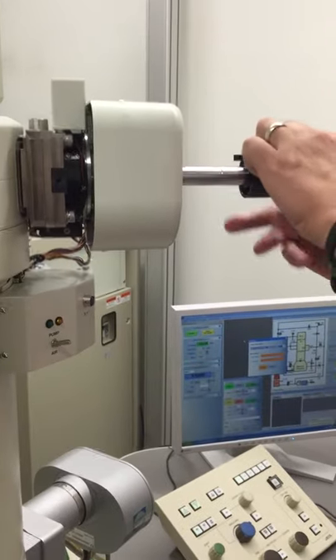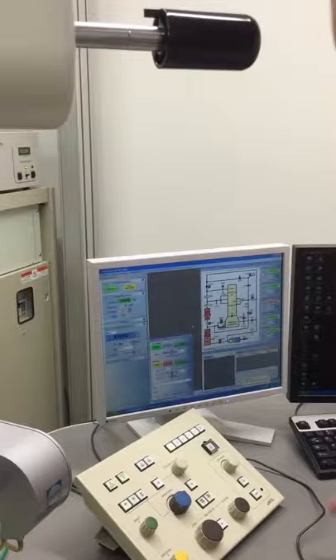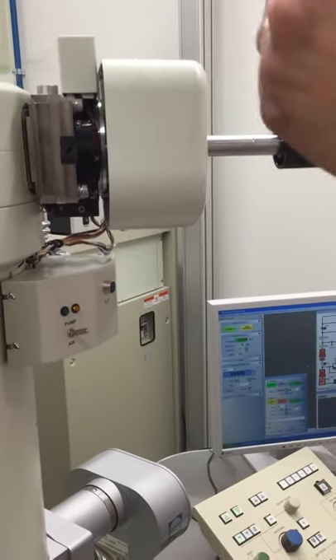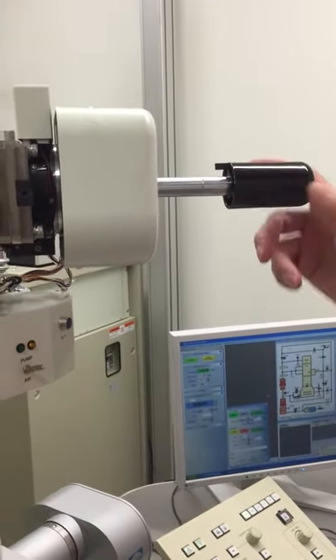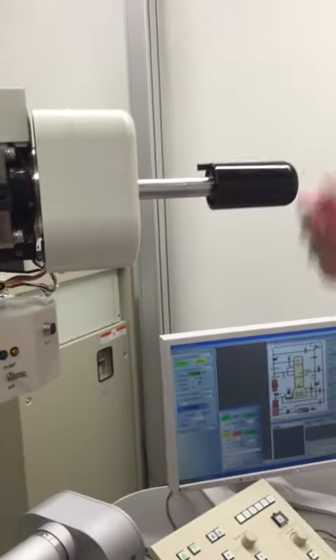You can ask me about the specimen holder. Technically I don't have to hold it, but on the Tecnai microscope that we had, it always gave a little puff of air that shot my sample in, so I'm just programmed now to not let go. I'm waiting for the light here to go from yellow to green, and then I can insert it all the way.